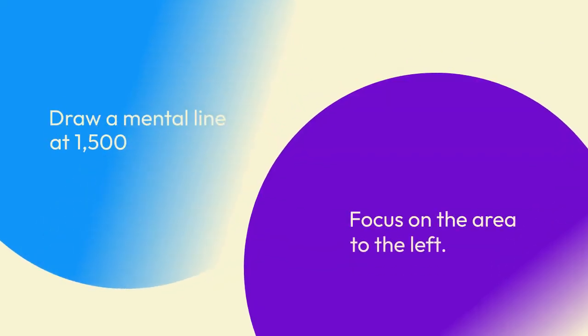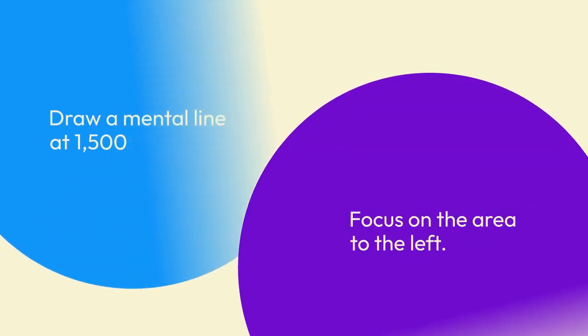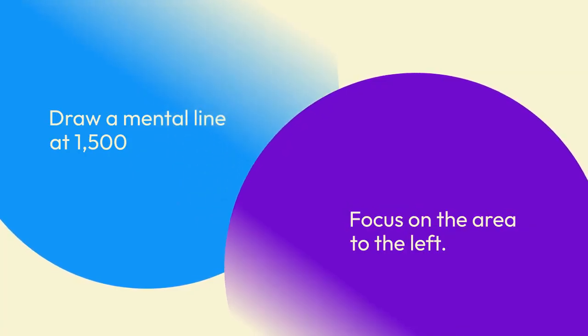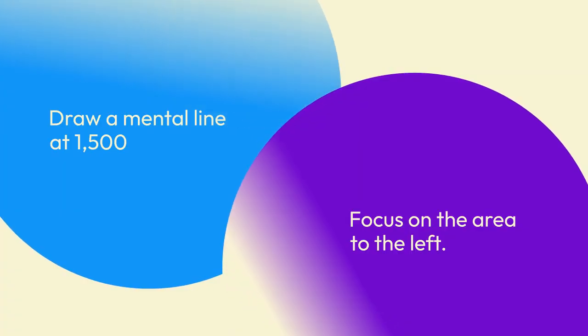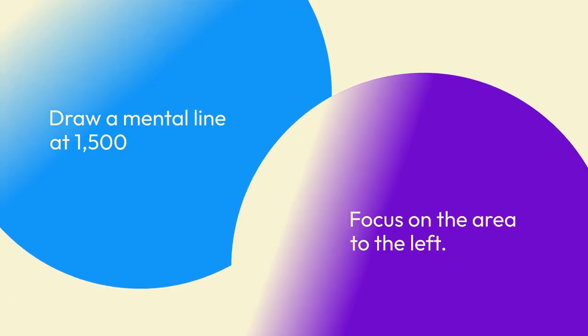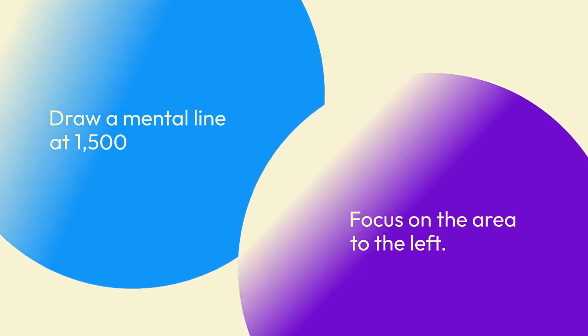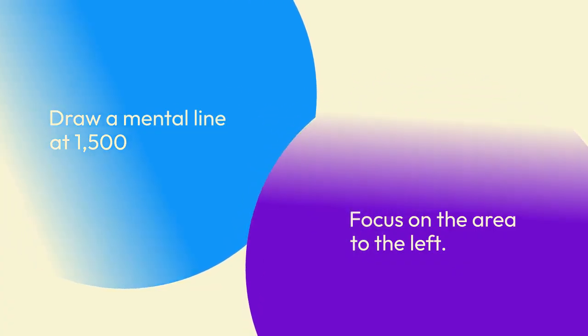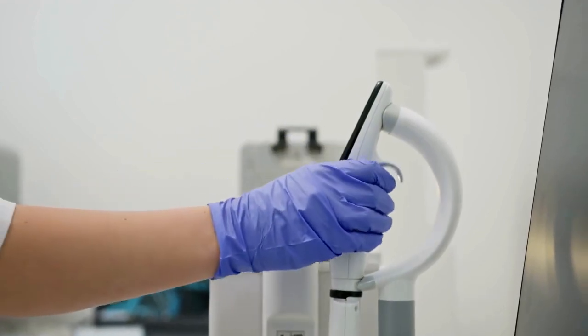So, the strategy is simple: draw a mental line at 1500 and focus on the area to the left. Look for a big broad OH peak, then look for a strong sharp C=O peak. By systematically looking for what is there and what is missing, you can confidently identify the functional groups and distinguish between different compounds.